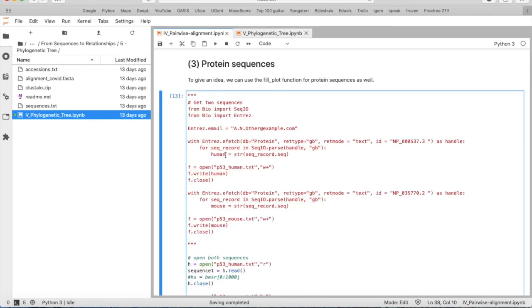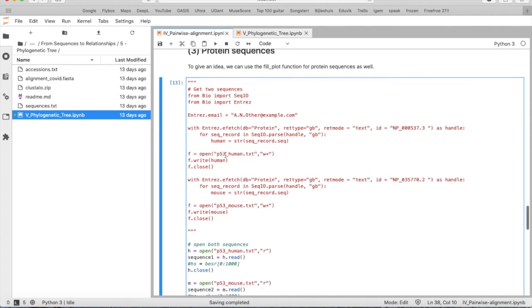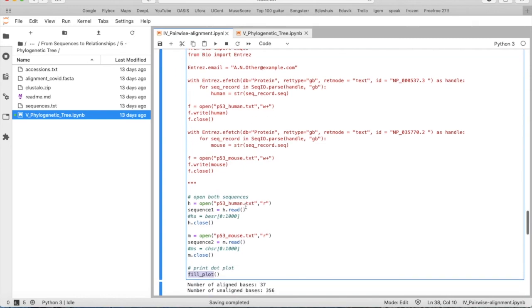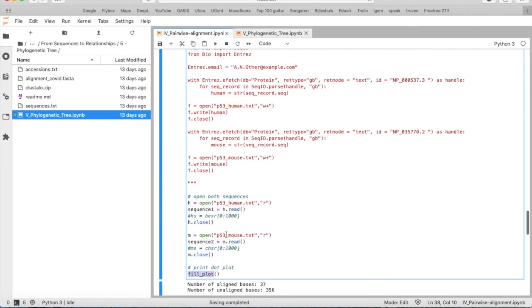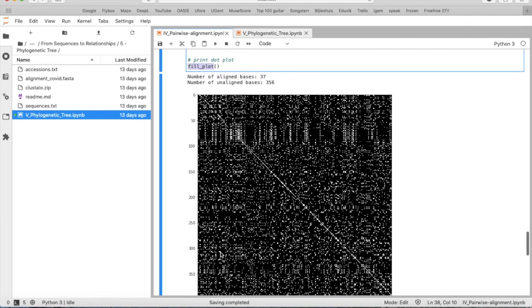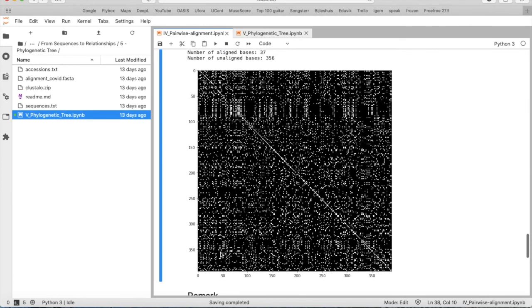So we can do the same for protein sequences. So I used the code of tutorial 1. And I obtained two p53 protein sequences from human and from mouse. I did the same as before. I used the fill_plot function. And I get this dot plot.